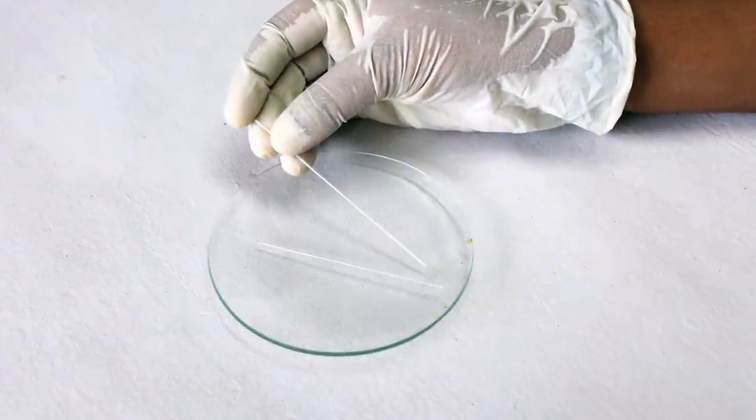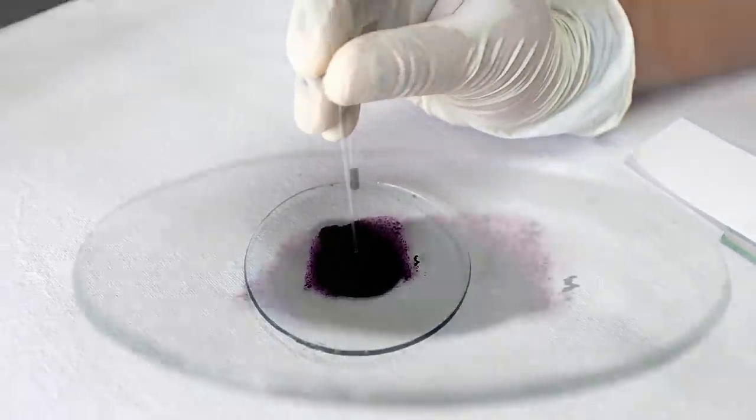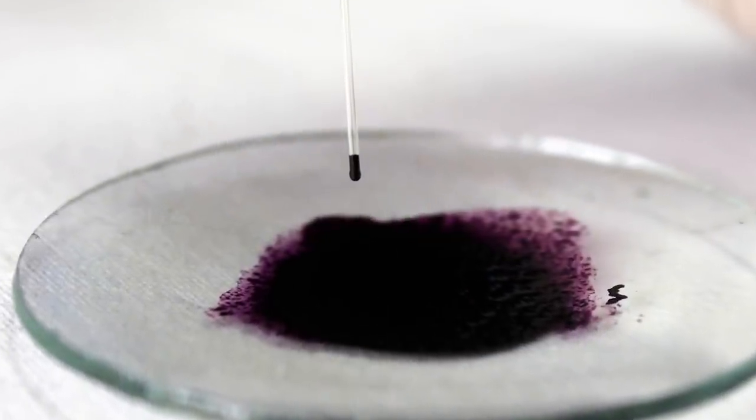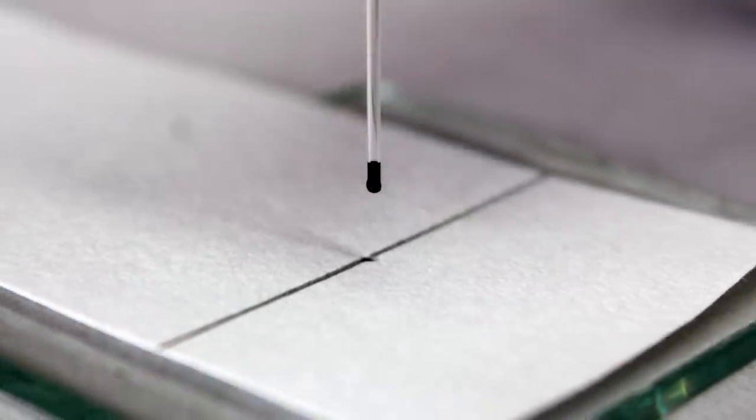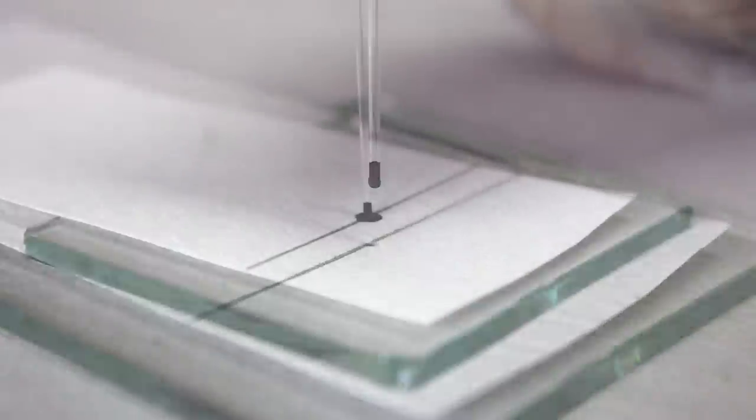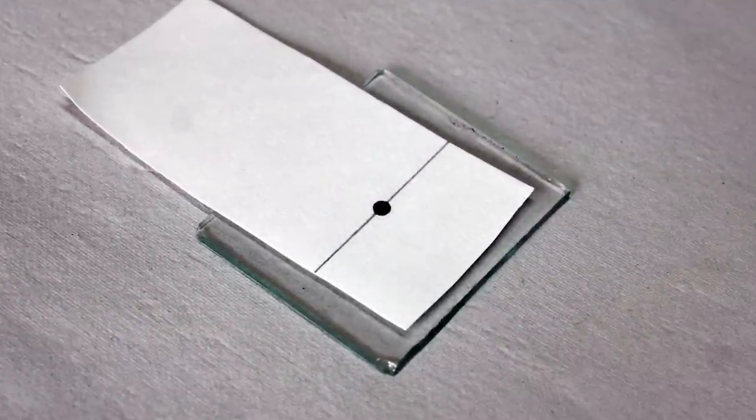Now, take a capillary tube and dip it into the beaker containing a mixture of red and blue inks. Using the capillary tube, put a drop of the mixture of red and blue inks at the central point of the line. Allow it to dry in open air.